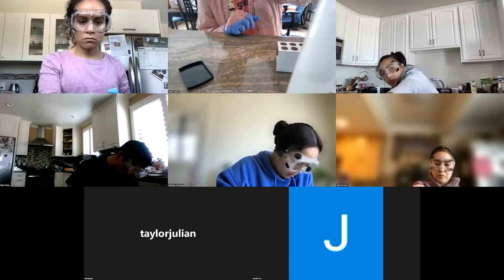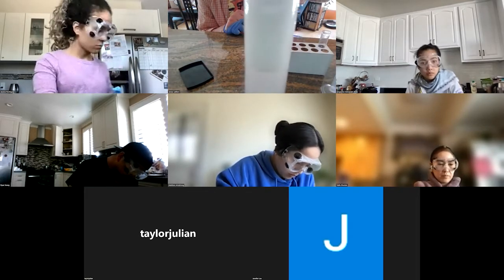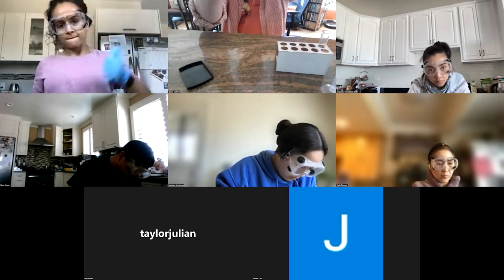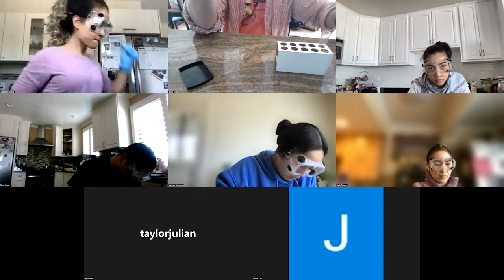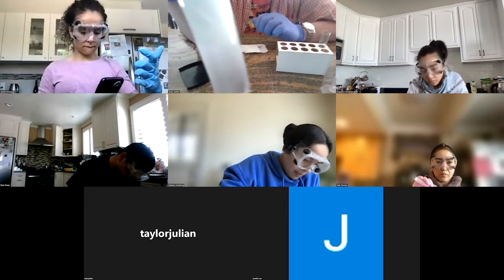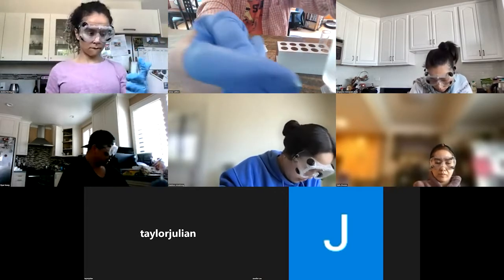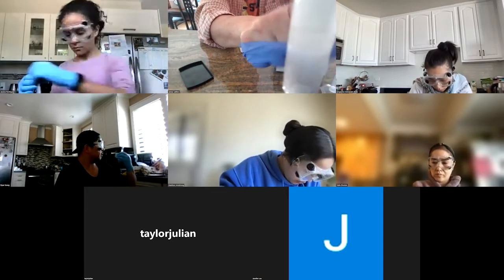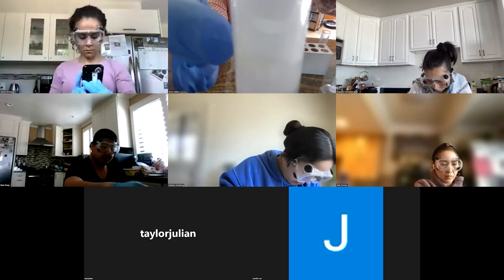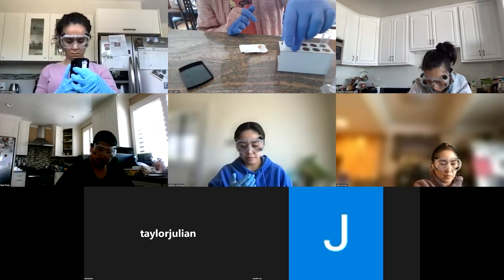Let me see a little bit there. You can sort of see 3 layers there, if you notice. There's an aqueous layer at the bottom, then a little bit of oil, and then the bubbles. But yeah, it took quite a while.